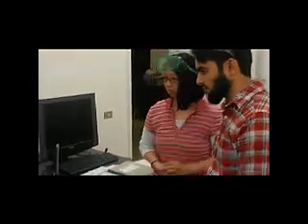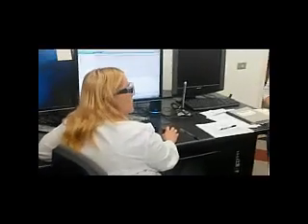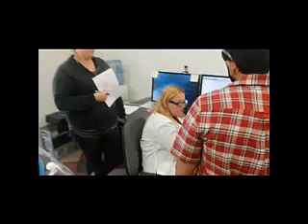Can we get it twice, just like a longer period of time? Right. So the clean runs right now are at 15 minutes. And so it's going to clean 15 minutes, then start over and clean another 15 minutes. Okay? Then once you change the name here, you're going to hit save and add queue, and it's going to start. You have to do Excalibur first.